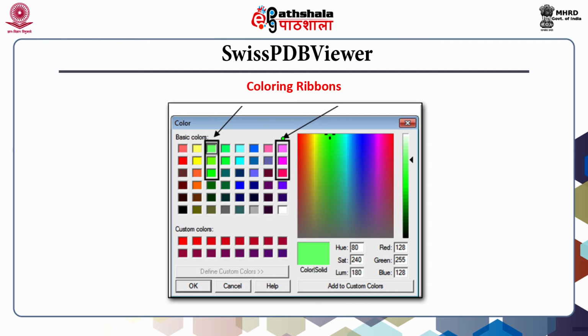These are boxed in the shown dialog box. For coils, use single color, that is yellow for each of the top, bottom and side. After setting the colors of each for helix, sheet and coils, click OK. After setting colors, the display of the enzyme OSBS will be shown in these colors.